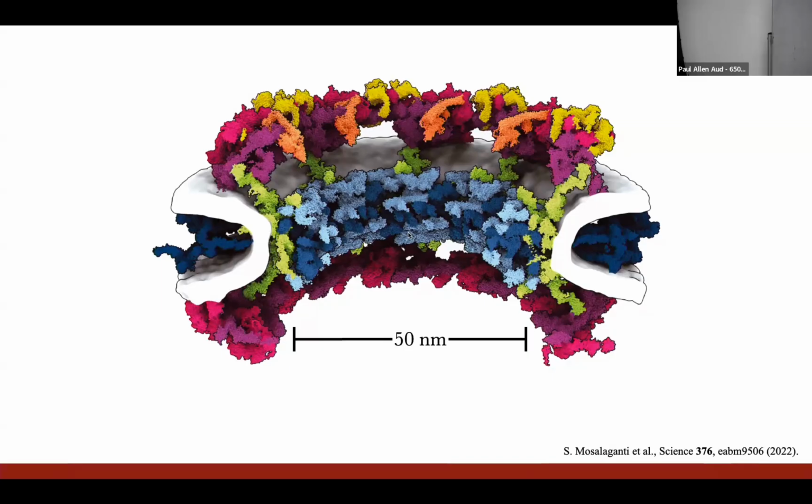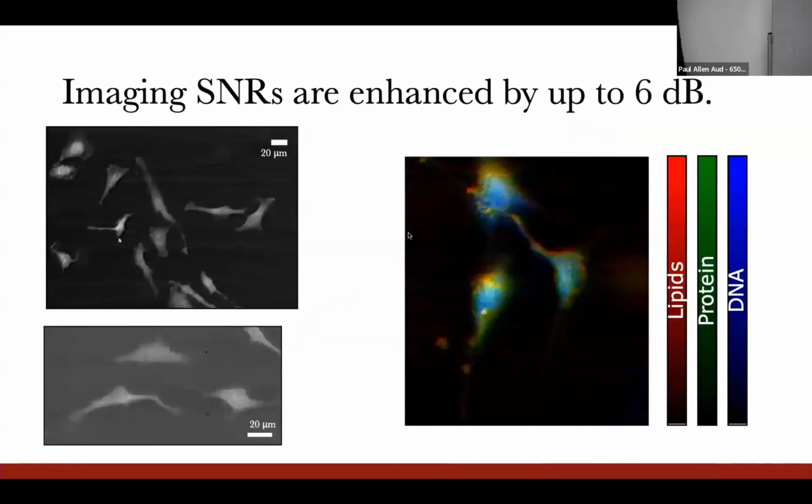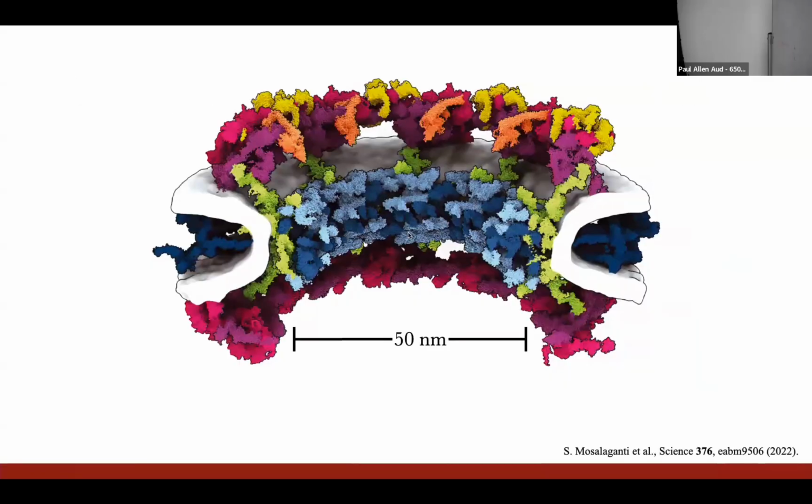At the end of that, it spits out this beautiful image, right, of this single protein complex that makes up a tiny fraction of your cell. But the point is, what are we missing here? We're missing conformations. We've done a lot of averaging, and so we can't see those stranger protein orientations that would be totally neglected by this algorithm.